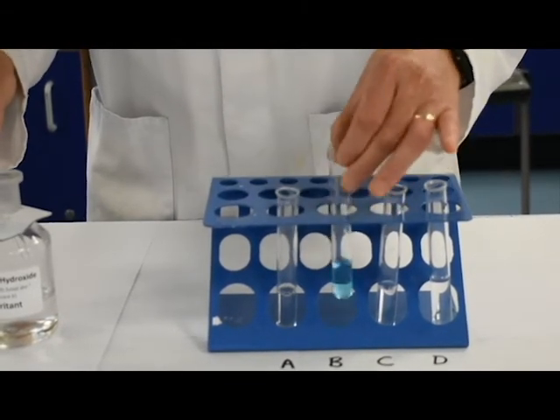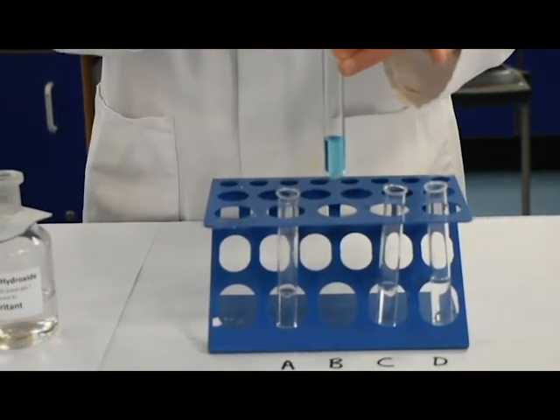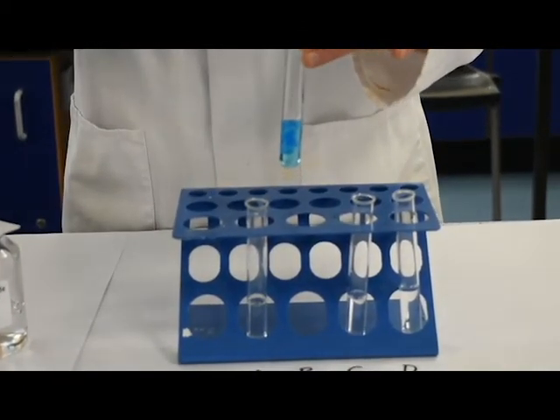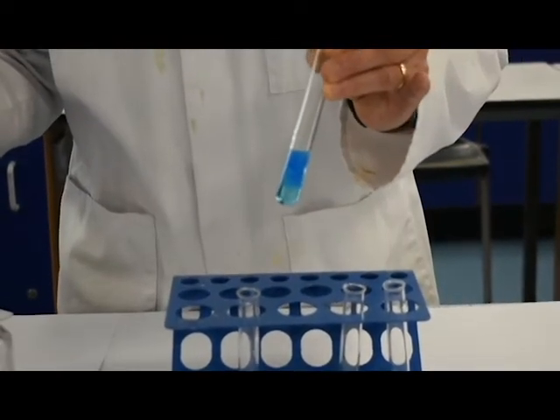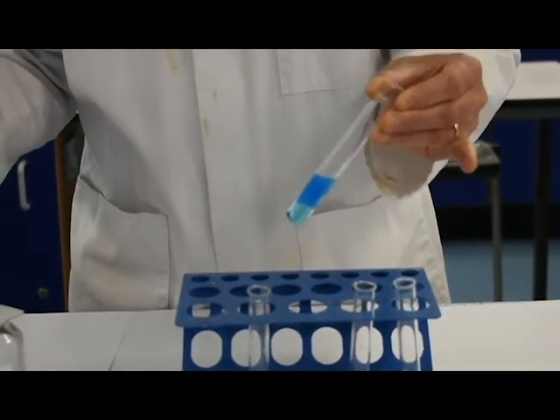And exactly the same thing with solution B. Oh, and you can see there, I'll just put a little bit more in. You can see there we've got a result called a precipitate, and actually this type of precipitate is a bit like jelly, so we call it a gelatinous precipitate. So there's a blue gelatinous precipitate formed.